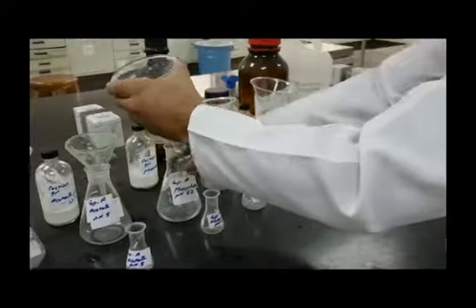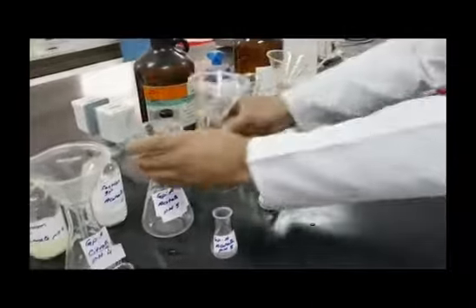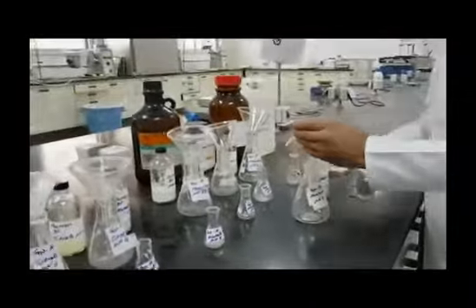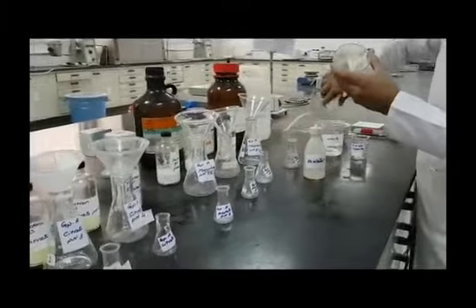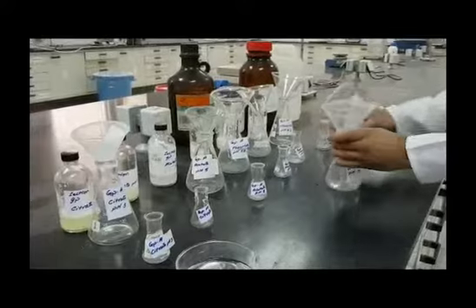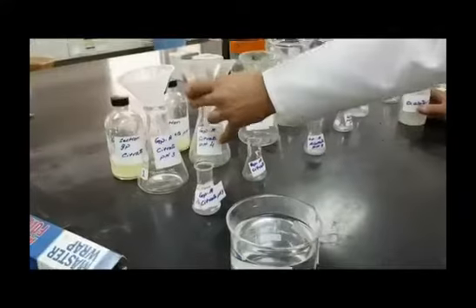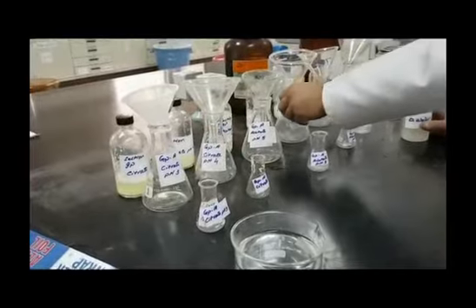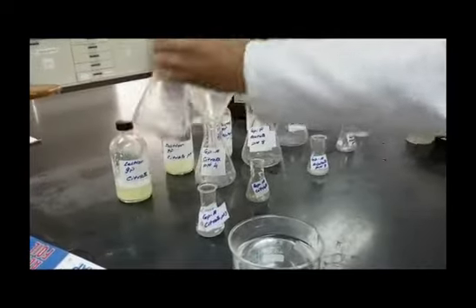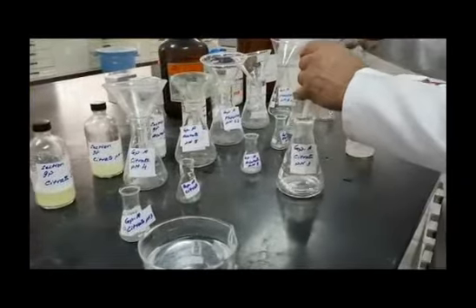All Erlenmeyer flasks that will be used for filtration and also for sample dilution should be labeled clearly using section number and group number, as well as the solvent, buffer solution, agent, and pH. Always prepare a beaker labeled as waste to collect all remnants or residues.